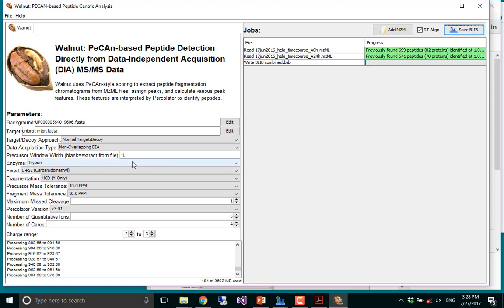And then second, it's going to decide which sample has the best representation of this particular peptide. Of the peptides it detected, it'll say, okay, I found the best representation in the 0 time point, or in some of them, it'll find it in the 24 hour time point. After it's done all of its detection of which is the best representation of that peptide, it's going to go back and reintegrate that point in both of the files. So it's going to figure out what the rates are.